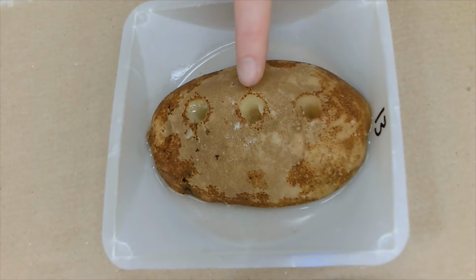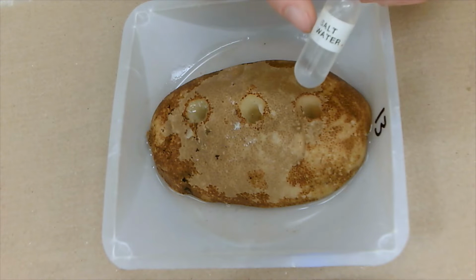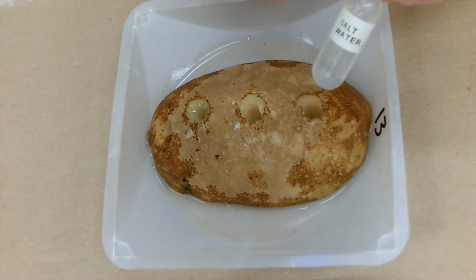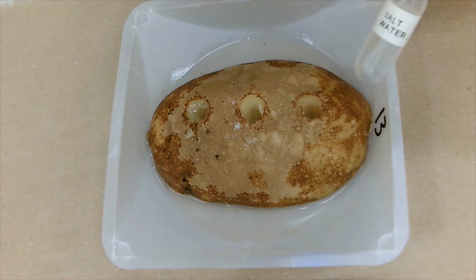In the middle hole, you're going to be taking the salt water and you're going to do the exact same thing. You're going to be filling up the hole and you're going to stop when it gets to almost filling over because you don't want it to overflow right away.